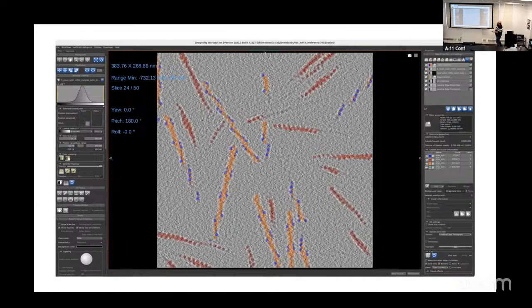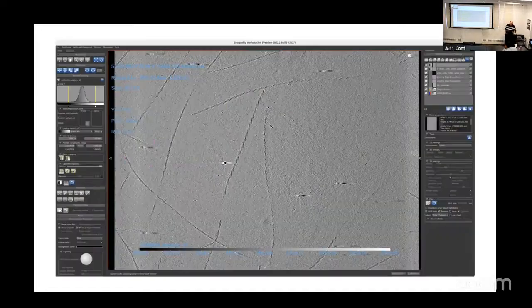Oh, there we go. So this is what the ground truth looks like when you lay it over it, right? So this is the CPS outputs in Dragonfly. And you can see that the red is actin and the cofilactin is orange, but it has these cofilin molecules decorating the outside of them. Now, if you train a network to find them, it initially finds them all as actin, and then it starts struggling, goes back and forth. But eventually it figures out how to segment all of those classes.